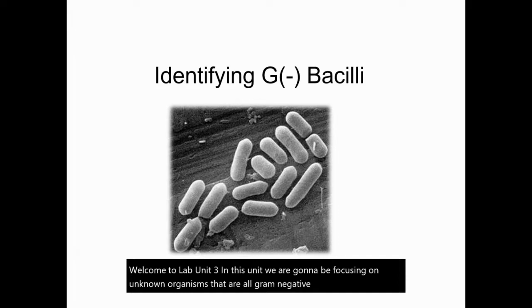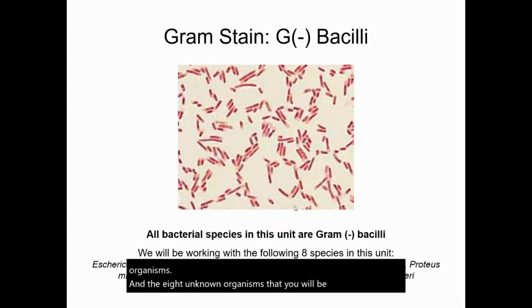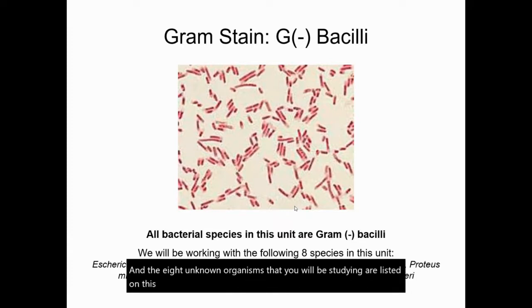So with this unit, you are going to want to focus on observations, results, and interpretations as they apply to the different media and tests that we are going to talk about as we seek to identify our 8 unknown organisms. And the 8 unknown organisms that you will be studying are listed on this slide. They are covered by the captions, but you have them on your PowerPoint.